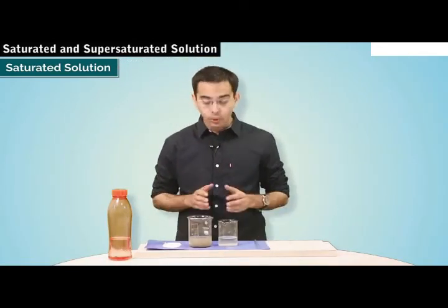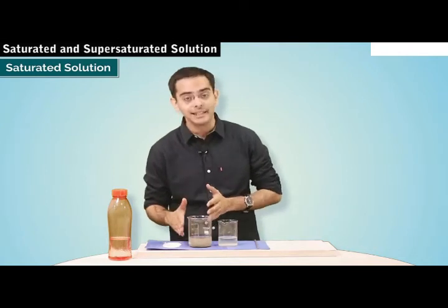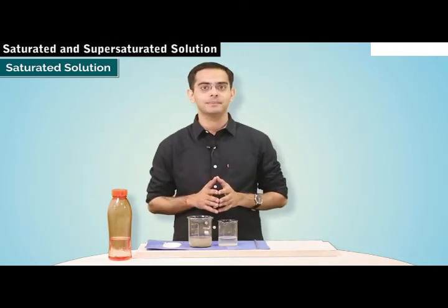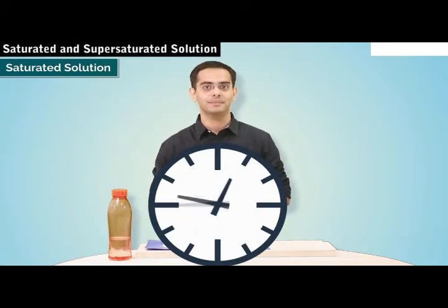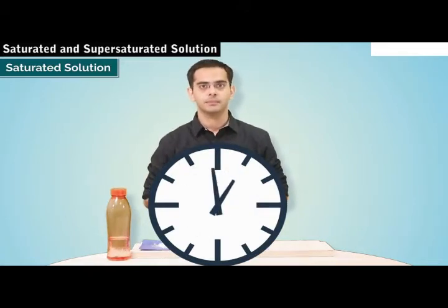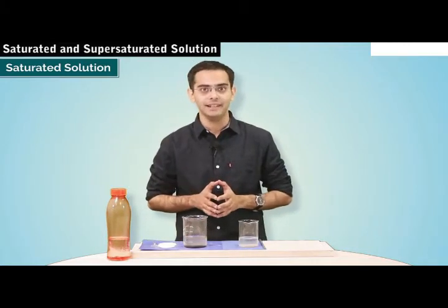And now students, we are going to leave this mixture undisturbed for a certain duration of time so that the sand particles settle down at the bottom. And thereafter, we are going to decant this solution. Now we can see that the sand particles have settled down at the bottom, while the salt has dissolved in the extra amount of water that we had added.